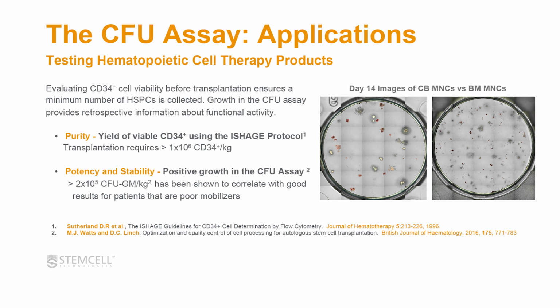And that way you can ensure that if you needed to mobilize the patient for longer and their CD34 wasn't up to the levels that you needed, you could use flow to make sure that you did get enough cells from that patient, if at all possible. In some cases, patients that don't mobilize well are recognized after 3 or 4 days of mobilization with GCSF that it's not enough. So the patients get Mozobil to really improve the number of CD34 cells they have. So for transplantation purposes, they try and get a dose of at least 10 to the 6 CD34 cells per kilogram.